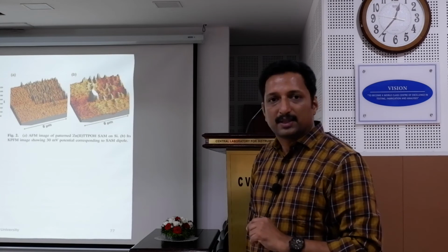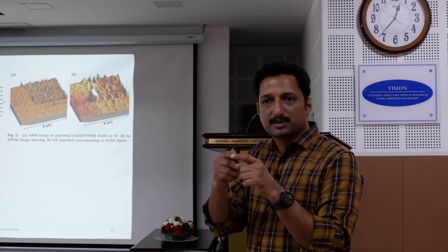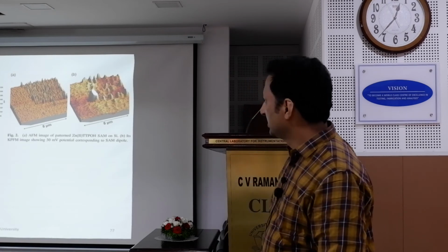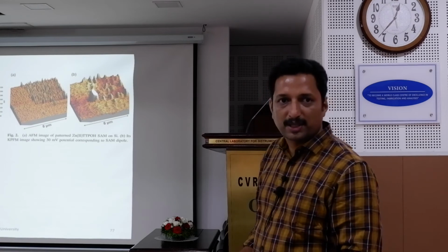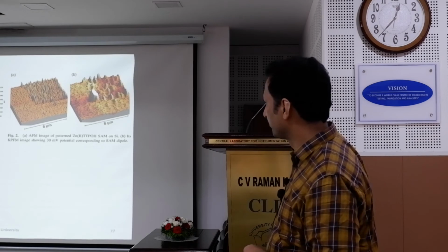Okay, that will measure on a large scale, not on AFM scale. On a large millimeter scale, you can measure the work function of materials using Kelvin probe. That is not AFM. All Kelvin probes are not AFM, but this is Kelvin probe AFM. In AFM we use the Kelvin probe.